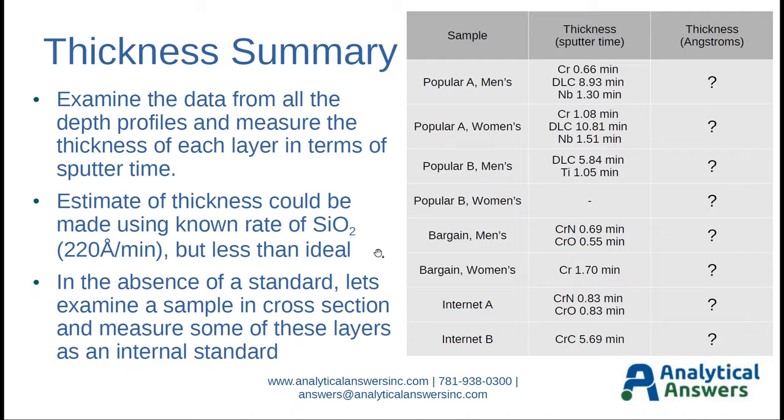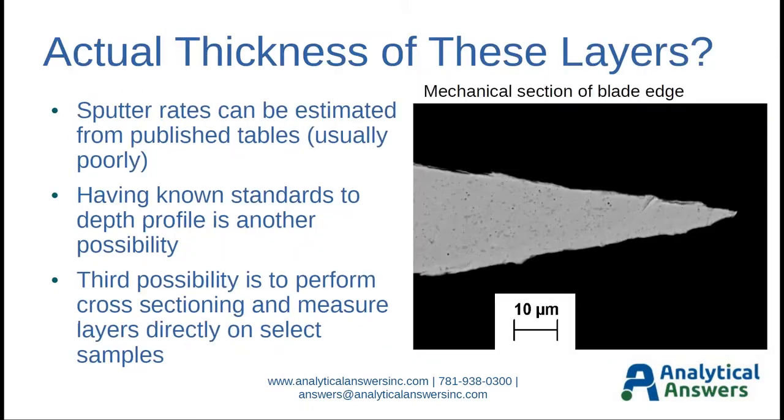But instead of a depth profile standard, let's talk about doing cross-sectioning on one of these samples, the top one, in order to get some thicknesses to use as a kind of an internal standard on our study.